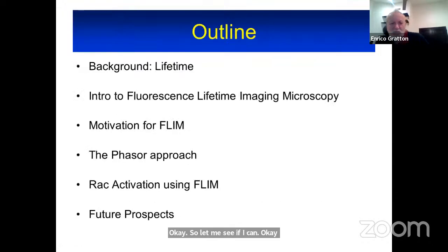Okay, so I want to start with some background in lifetime, although this is not needed after Dave's lecture. And in the introduction, I want to talk about what is lifetime imaging microscopy, which was the goal of the first grant I applied, and then what is the motivation for FLIM and where the phasor approach comes in, and then I will talk about some biosensors. Okay, so let us see the next.